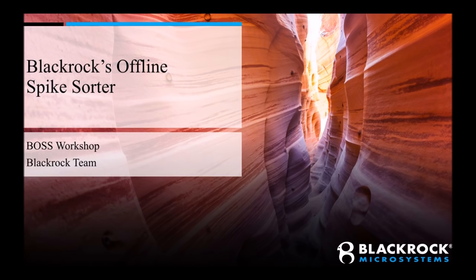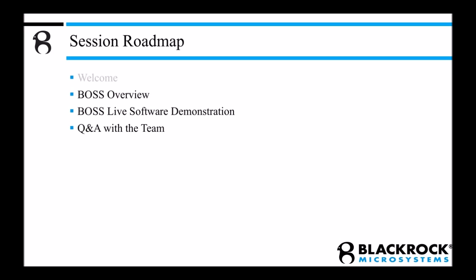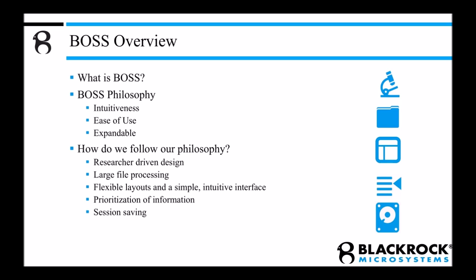We're very excited to introduce BOSS to you, so I'll just get right into it. BlackRock Offline Sorter is an easy to use yet powerful software for viewing and classifying spikes or previously recorded action potential waveforms from high impedance electrodes.